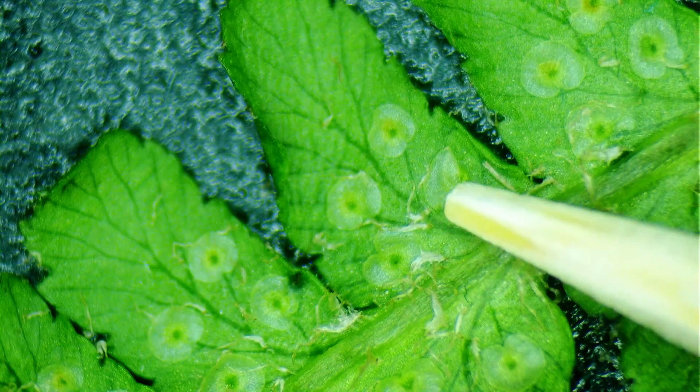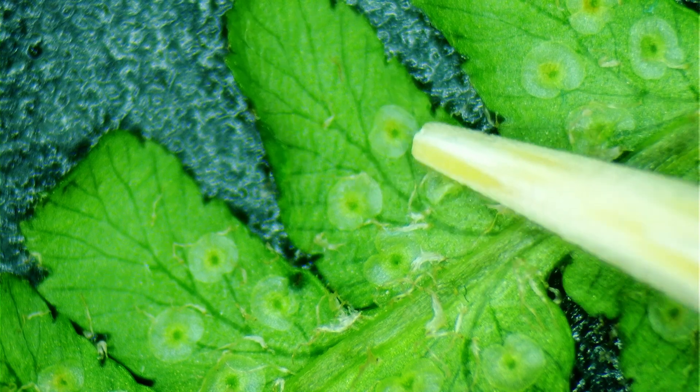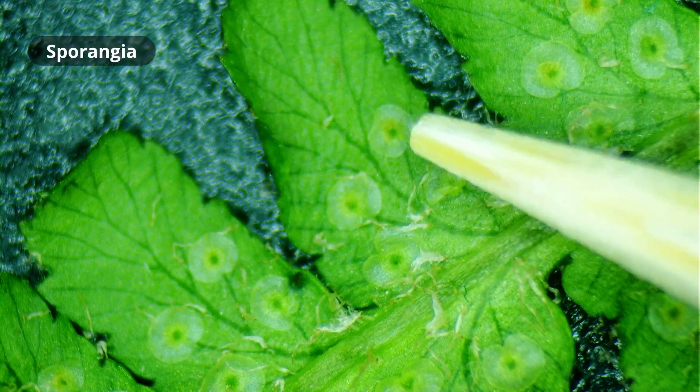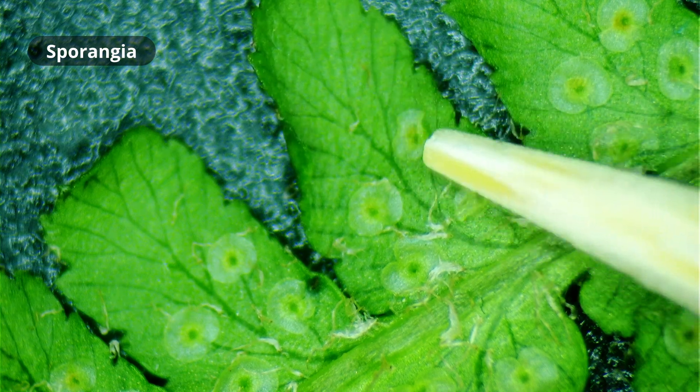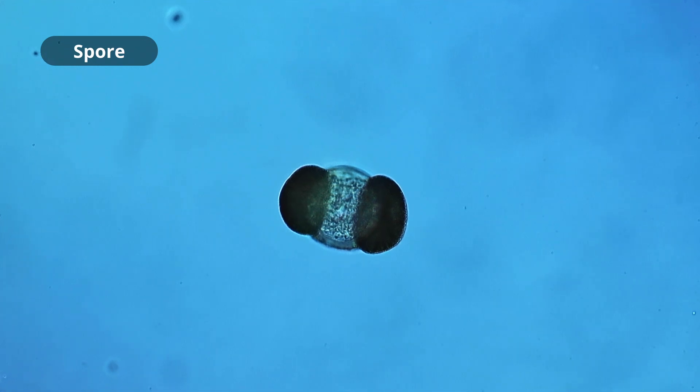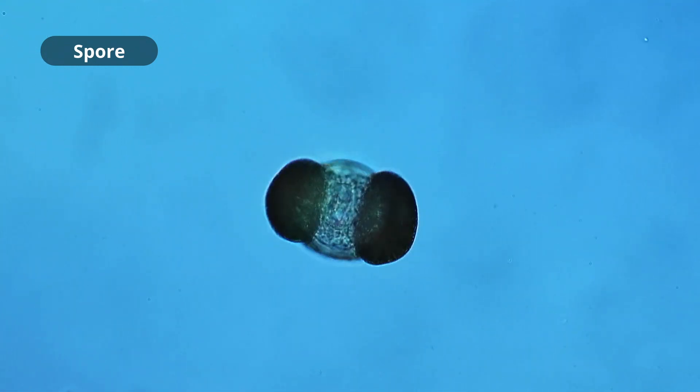What you see here on the backside is the so-called sporangium, which produces those spores. These sporangia that produce the spores can be found on the bottom side of the leaf of the fern. Those spores are scattered, they fall to the ground, and they start to germinate and grow. They start to form a very tiny fern plant that's less than a centimeter across.